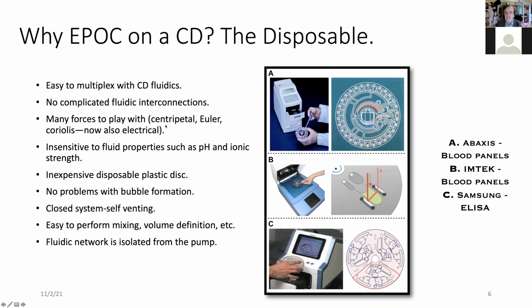Now, from the physics point of view and the operational point of view, this spinning allows you to access three major forces. One is centripetal, so that means I can spin liquid from the center outwards, right? Centripetal force will go this way, outward.